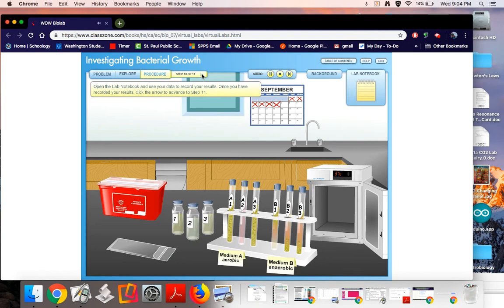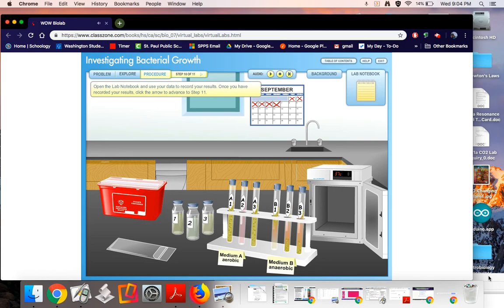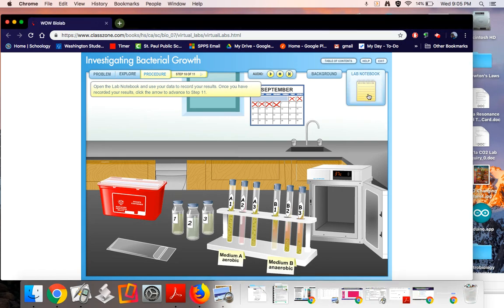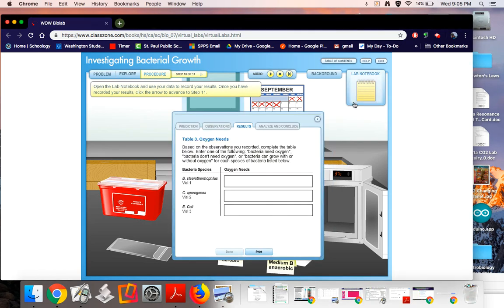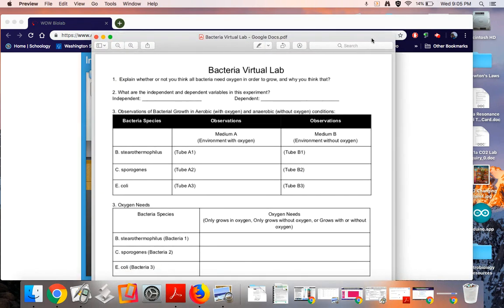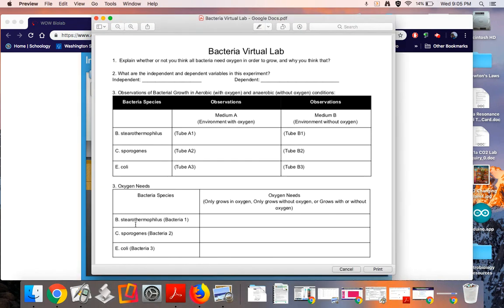Open the lab notebook and use your data to record your results. Once you have recorded your results, click the arrow to advance to step 11. Okay, so in this next step now let's start thinking about it. In each of our three types of bacteria, bacteria 1, 2, and 3, what type of oxygen does it need? Does it only grow in oxygen, so that would be in the medium A?